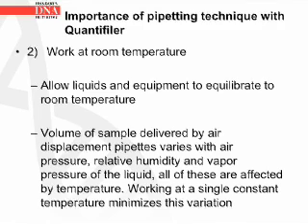Tip number 2. Work at room temperature. Allow liquids and equipment to equilibrate to room temperature. The volume of the sample delivered by air displacement pipettes varies with air pressure, relative humidity, and vapor pressure of the liquid. All of these are affected by temperature. Therefore, working at a single constant temperature will minimize this variation.